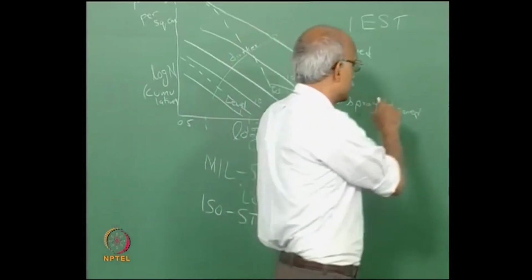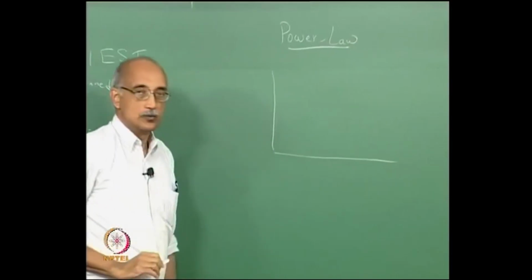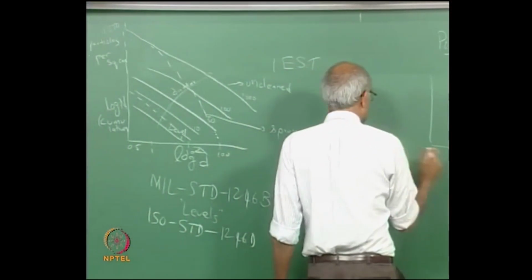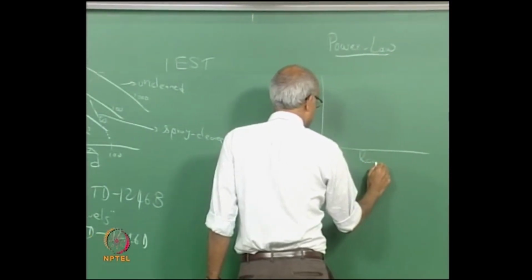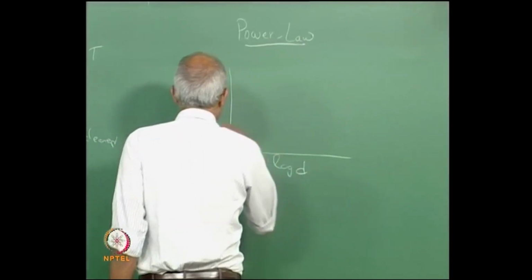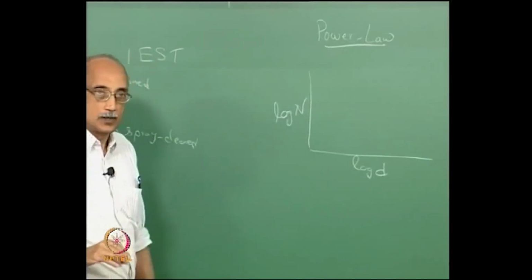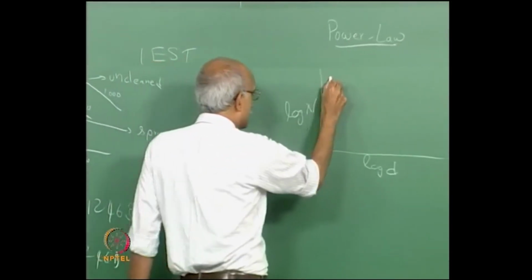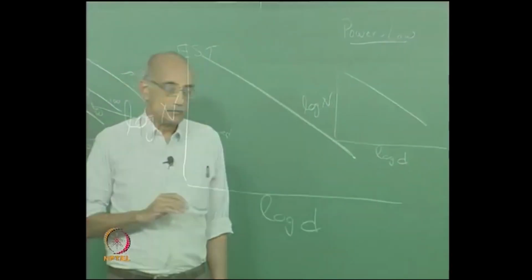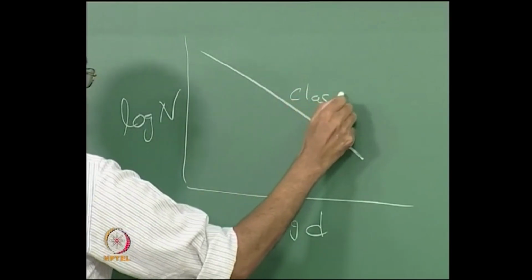So, when we look at the particle size distribution in such a clean room or controlled environment, and again we plot, in this case, log of the diameter versus log of the particle count, we see a similar straight line, and these are called class lines.